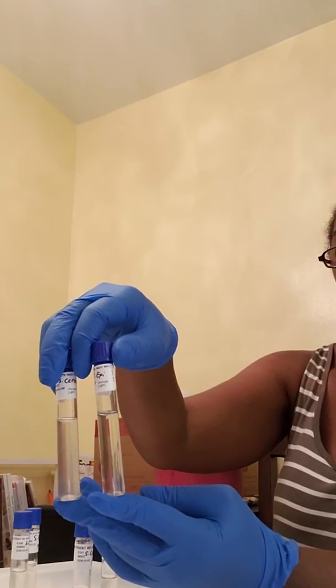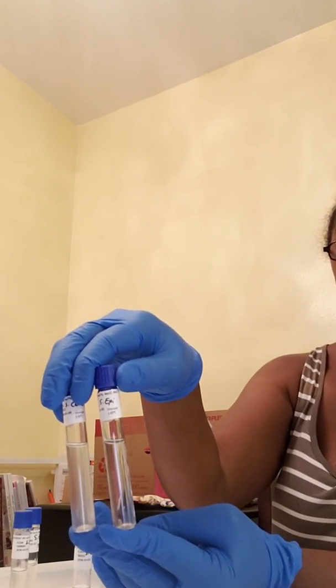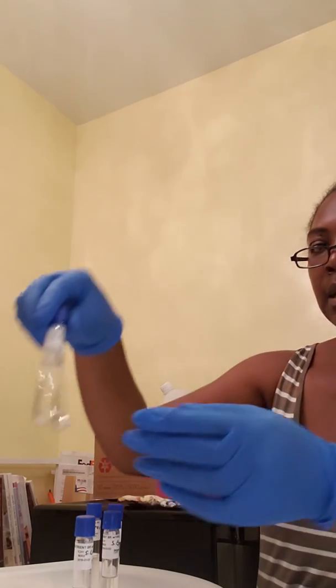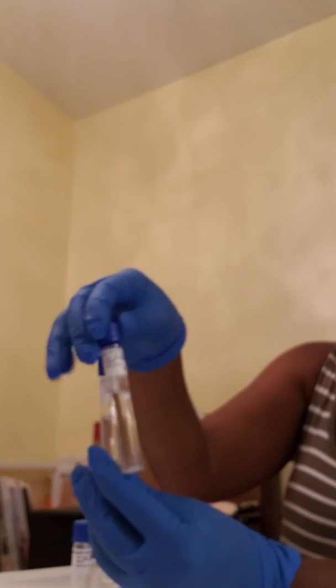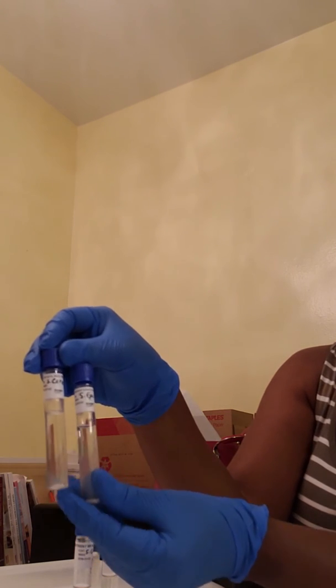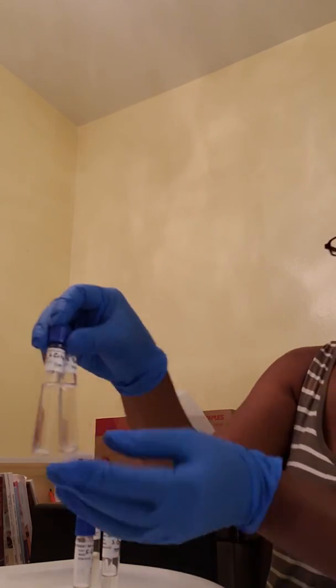The epidermidis basically is no growth or hypertonic, which means that the cells just dissipated. Whatever growth there was, it dissipated. Next, I will show you the 1%. It's very little. This is cerevisiae, a little bit of turbidity. Staphylococcus epidermidis, a little bit of growth. Very little.